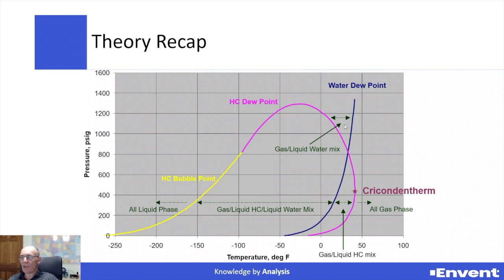So with different sampling systems and different analyzers, we can remove the water dew point to ensure that the hydrocarbon dew point is the first dew point that is measured. So please bear in mind this phase envelope diagram and refer to this phase envelope as you consider the measurements that you're making. Now, a phase envelope diagram like this can be dropped out of GCs, or constructed through hydrocarbon dew point analyzers and water dew point analyzers. So it's a piece of information that is readily available, but important that you have and get to know and understand.